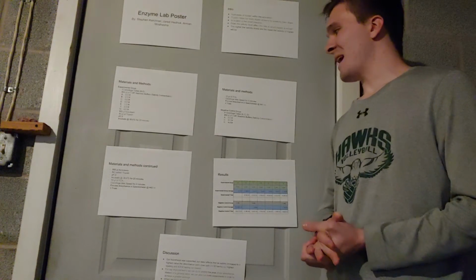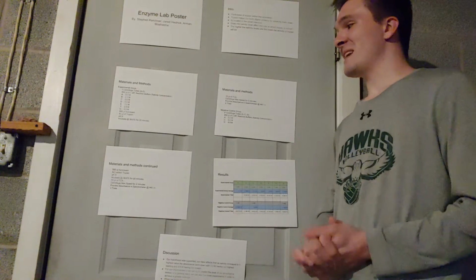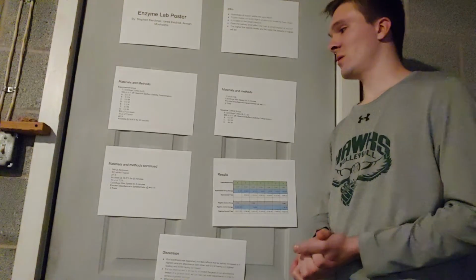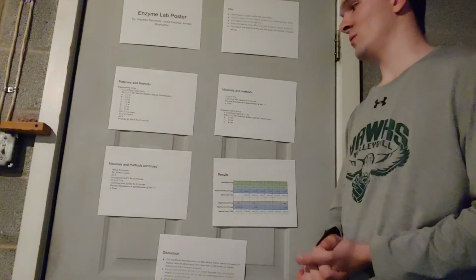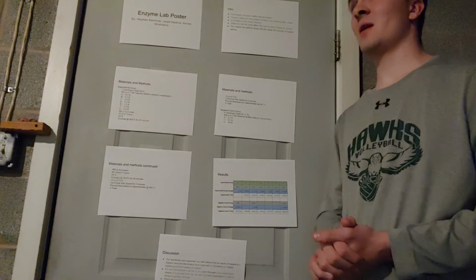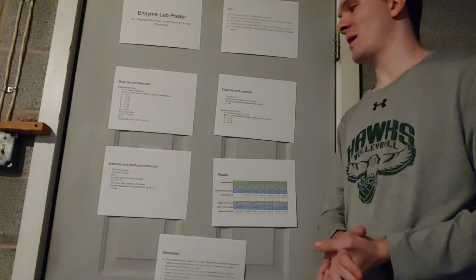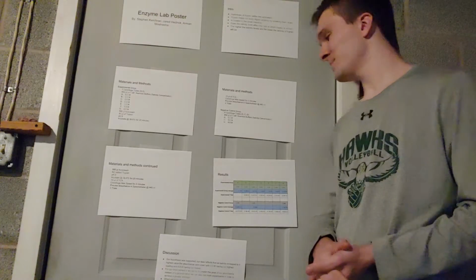That is why we did that, and it was the same process, just only doing 3, and instead we did not add any trypsin to react to. So we can see in our results later that it made a big difference. And again with the centrifuge, we centrifuged it, even though the supernatant was very small, as predicted. We still had to get as much as we could out before we put it in the spectrophotometer.